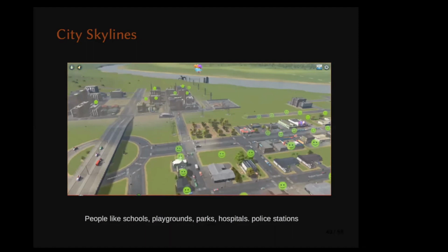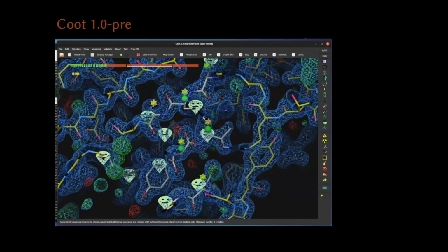So likewise in Coot, you can change a peptide, you can fit a rotamer, you can change a Ramachandran angle, so that the residue at the center of the screen improves, or the one that you're operating on, and the residues in the local environment can feel that change as the minimization occurs. And they can let you know that they approve of that change. The positions of those atoms is no longer compromised by trying to fit against the residue that's incorrectly positioned. So these, likewise, beam into existence and then they float up as if they're balloons, and then they fade away over a few seconds.